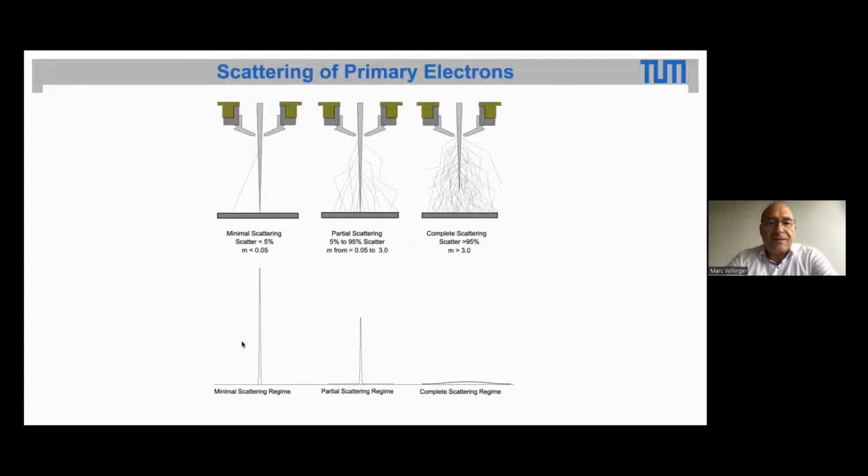And here's the reason why it actually still works. When you look at the good vacuum, you have all the electrons flying through this differential pumping aperture into the chamber, hitting the sample. And if there's a good vacuum, most of the electrons are getting focused to a point. Maybe there's sometimes a scattering event with a gas molecule in good vacuum. Now, if you have more gas molecules around, you get more scattering events. But the important thing is, as long as there's still some portion of electrons getting focused to one point, you still get a signal from this point.